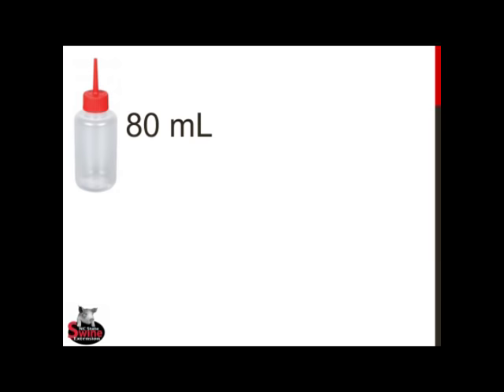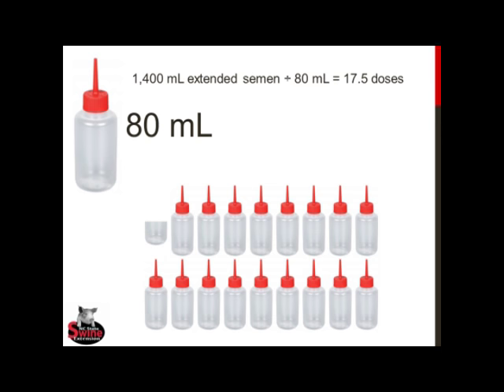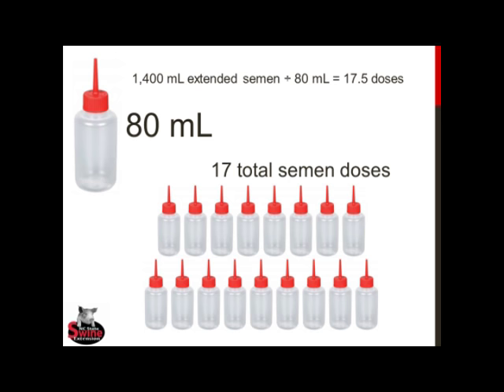For simplicity's sake, we'll aim for 80 milliliters in each semen dose. Dividing our total semen volume by the desired size of the dose, we find that we can make 17.5 semen bottles from this one ejaculate. There's no sense making a half bottle, so we'll allocate the remaining 40 milliliters evenly between the other doses, ultimately ending up with 17 doses, each containing a little more than 82 milliliters of extended semen.